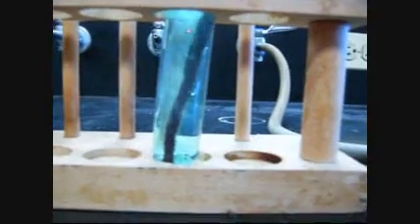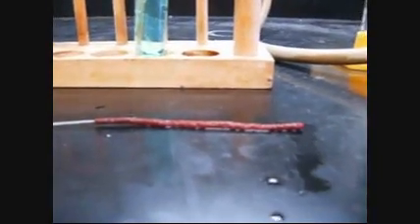Alright, we don't need to let it go too long here. We just need a little bit of that stuff. And let's see if we can get a better look at it here. There you go. You see the color there. It's kind of a reddish brown. Kind of a reddish brown solid on there.